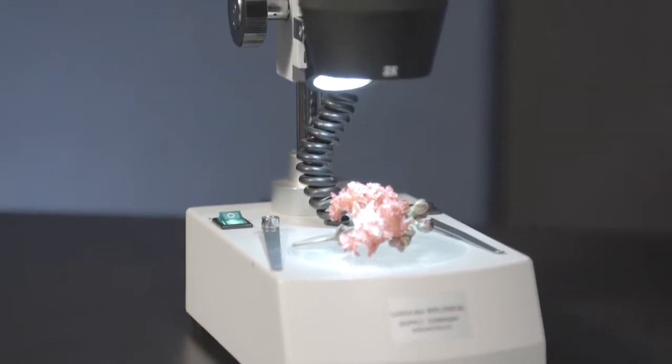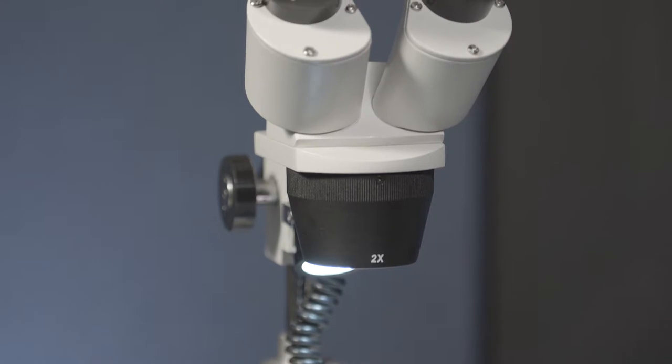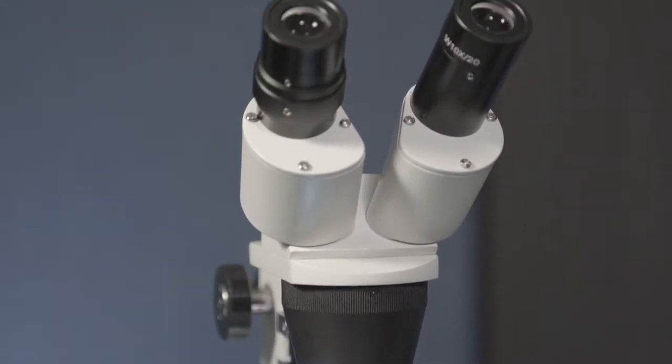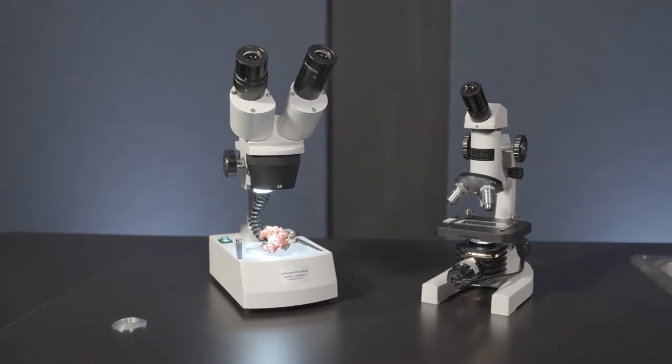Stereo microscopes are typically used to view small details in larger solid objects, such as rocks, plants, or insects, at 10 to 40 times magnification levels.